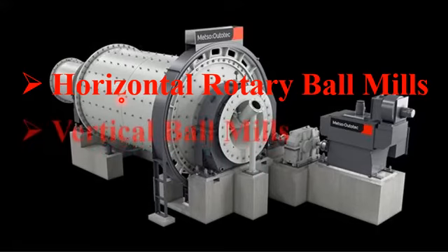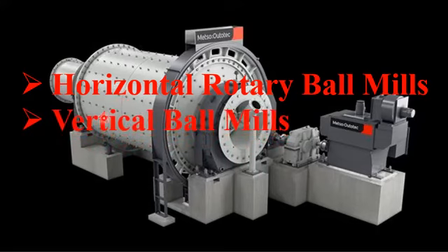Another type of ball mill apparatus is known as the vertical ball mill apparatus. I have also previously discussed this one. It is better in terms of efficiency, and the power usage of the vertical ball mill is less as compared to the horizontal ball mill apparatus. The rest of the setup of the vertical and horizontal is the same. Usually it is designed vertically, whereas the horizontal ball mill apparatus is designed horizontally.